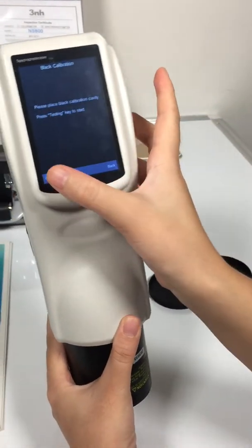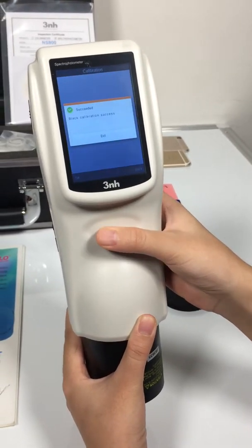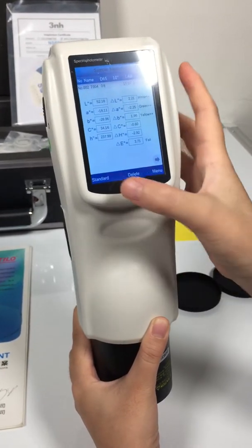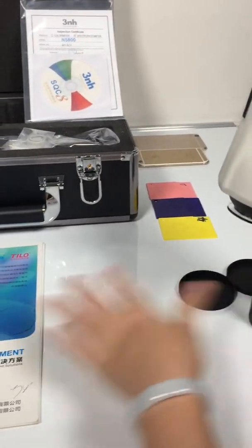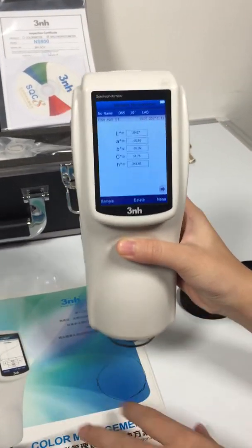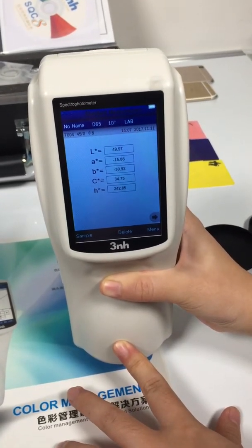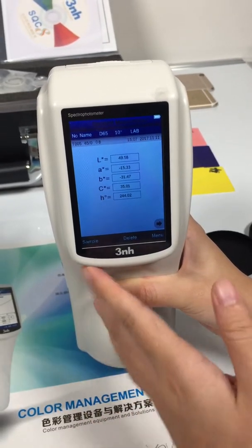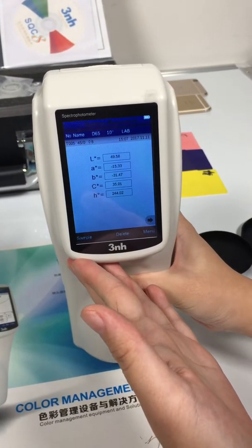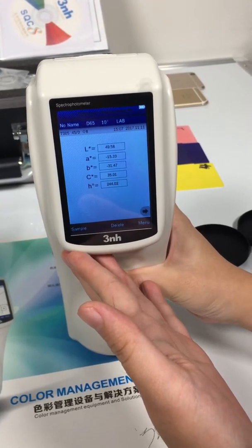Black calibration. Then we go back to the menu. First, we make the standard measurements. We can see the data about LAB. L means white and black, A means red and green, and B means yellow and blue.